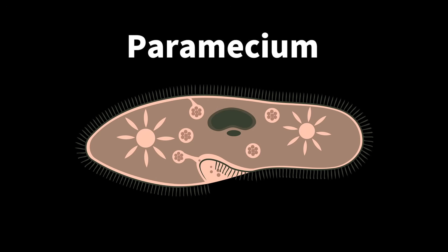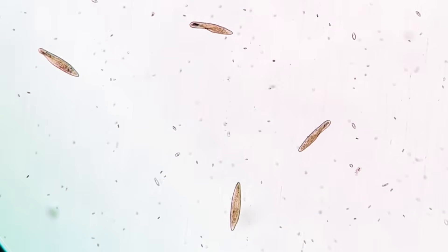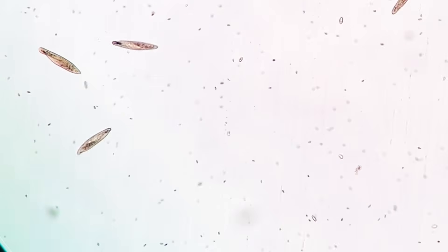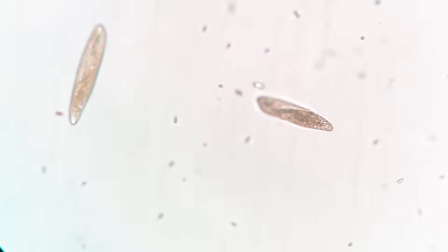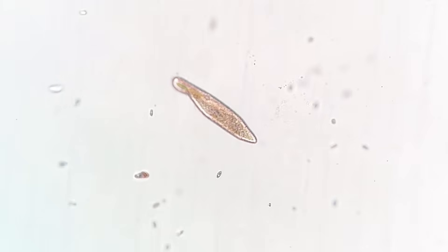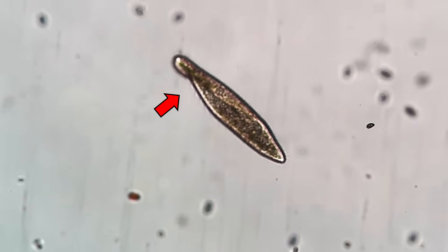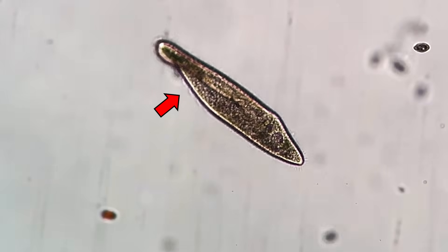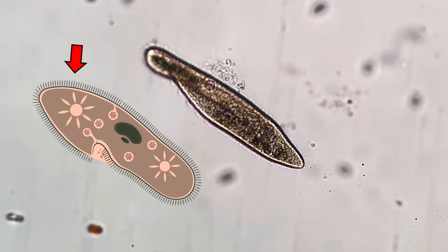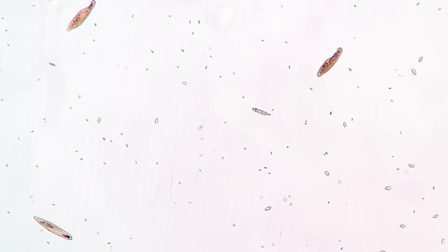Next up is the paramecium. Zooming in, can you see it? A brownish creature is swimming around freely. If we zoom in further, we can get a better look at its body shape. The English name paramecium comes from the Greek word paramekis, which means elongated. If you look closely, you can see tiny hair-like things moving around its body. A paramecium's entire body is covered in cilia, which it uses to swim through water.